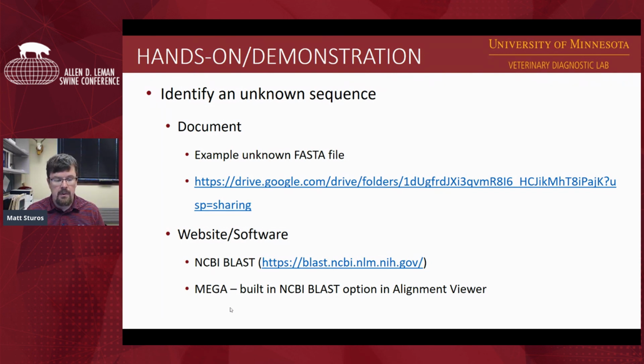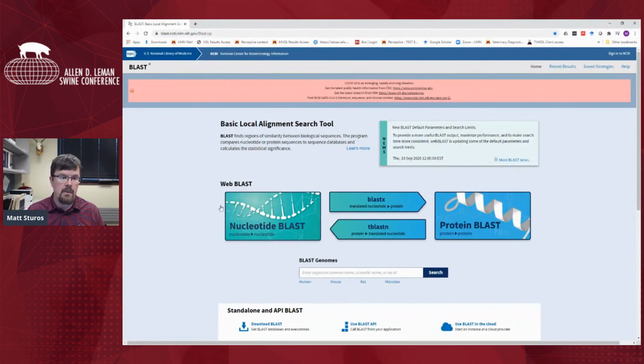There's also a BLAST option that's built into the alignment viewer of Mega. So I'm not going to go through that, but if you have the alignment viewer open, you can blast certain things out of the alignment viewer. So we'll open up BLAST here. So this is the BLAST website.